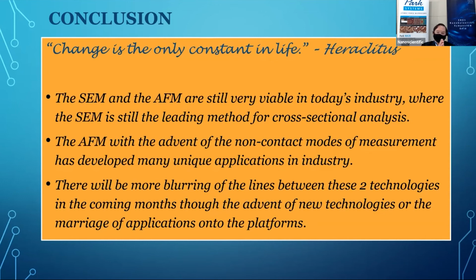In the past, people would just think, well, AFM is slow, I can only deal with very small samples. But now with industrial scale AFMs, I'm able to stick a whole 12-inch wafer into the system and perform the measurements without any destructive component. And with the scanning speed going up, it is comparable whether I'm using a SEM or an AFM to do the measurements.